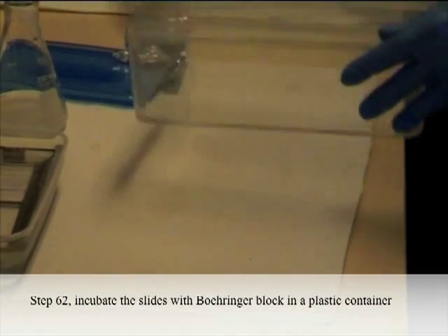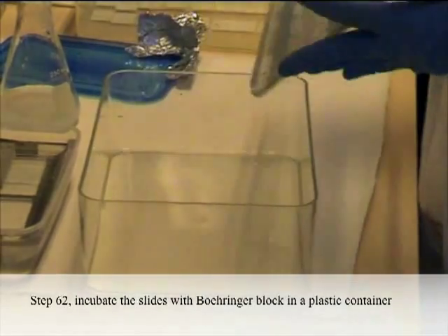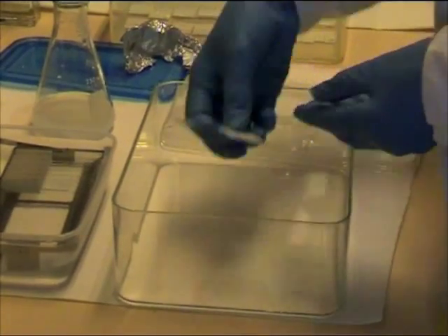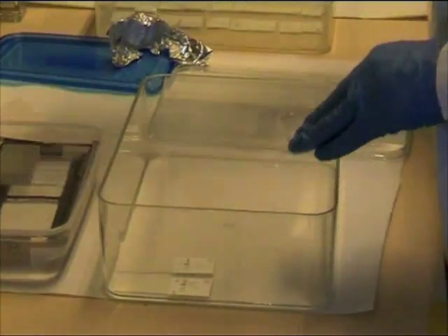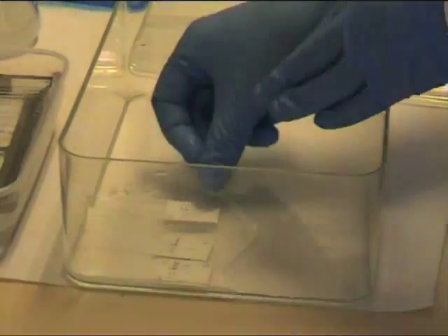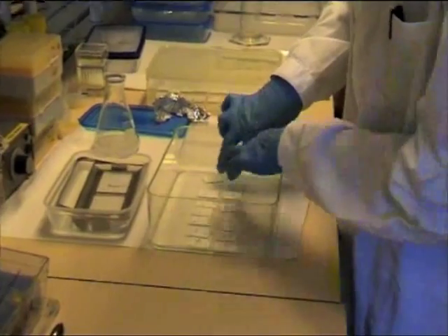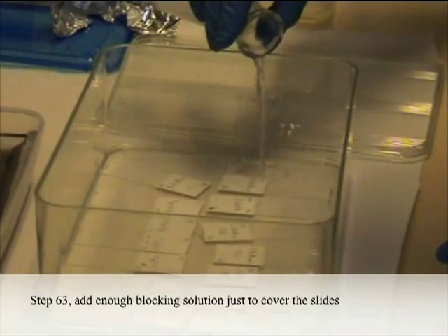Step 62: Incubate the slides with the Boehringer block in a plastic container. Step 63: Add enough blocking solution just to cover the slides.